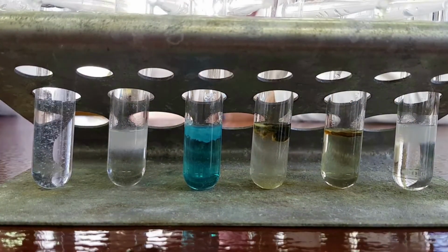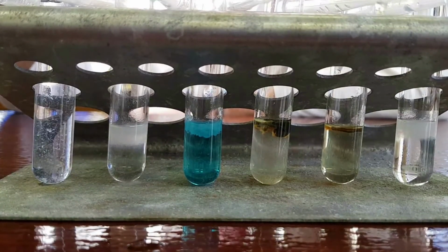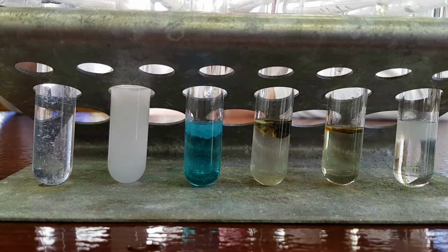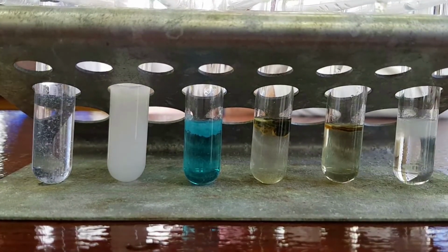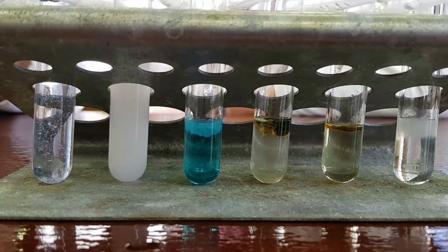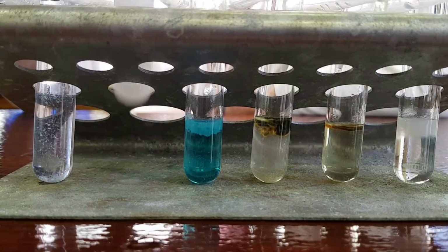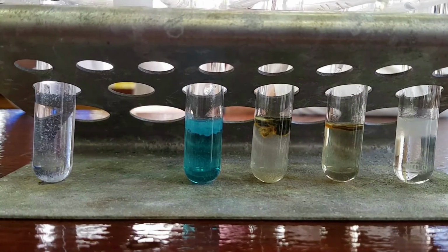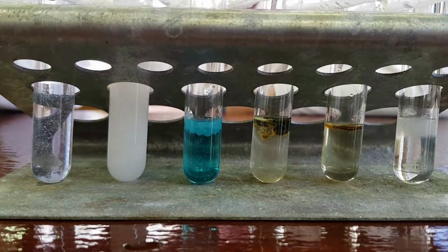Let's try the same thing with calcium chloride and magnesium sulfate. So first adding what we call an excess of sodium hydroxide. Giving that a quick shake. And the same thing with the magnesium sulfate on the right.